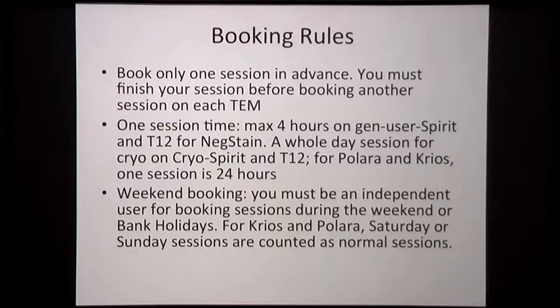But for the 2 data collection microscopes, each session we define as 24 hours. So it's normally 9 o'clock to the next morning 9 o'clock. It depends on how you're going to use it. Usually you start loading your grid in the morning and set up until lunchtime. Then you will already get a rough idea what grid you have. If you have a good grid today, then you set up EPU or do your manual low dose collection.